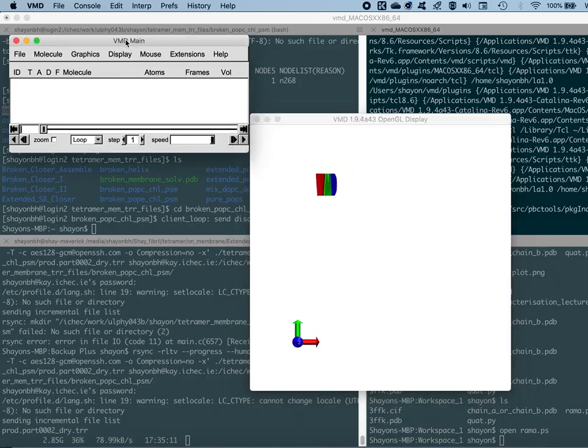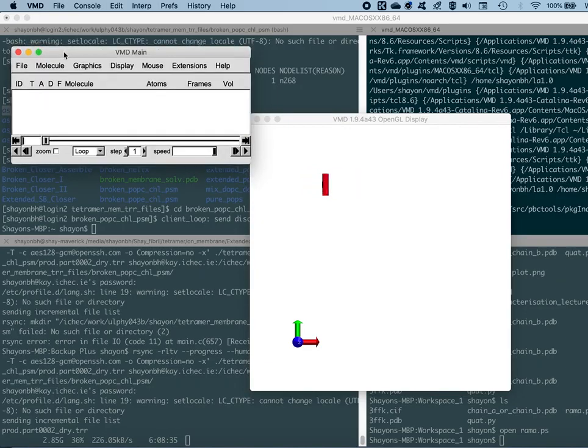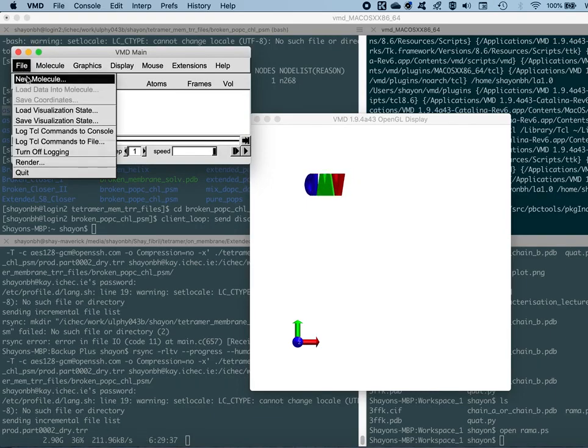So for this, we'll use the PDB file that we have already downloaded, which is the 3FFK, and that's the gelsolin actin complex, along with the water molecules and the calcium ions and the ATP molecule together. We'll just go ahead and load the structure first. That's the PDB with the ID 3FFK. I have it downloaded already.